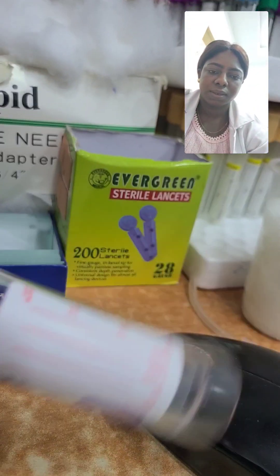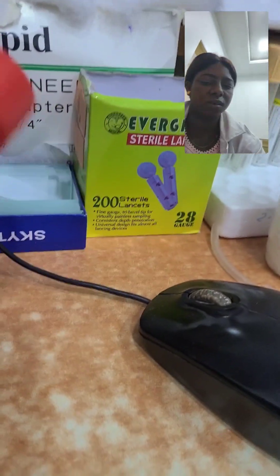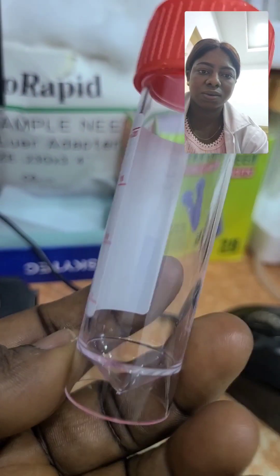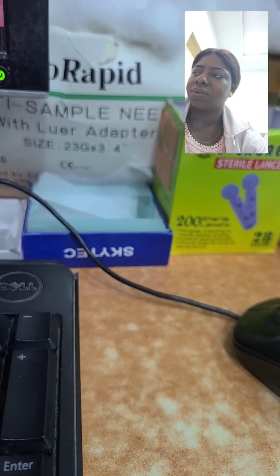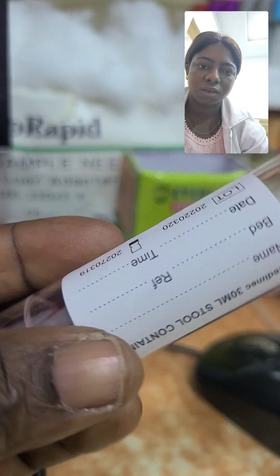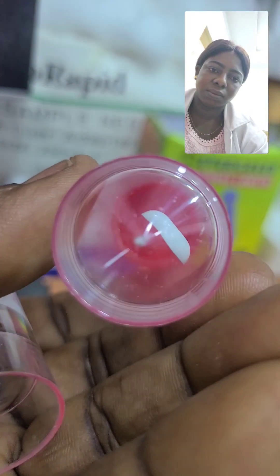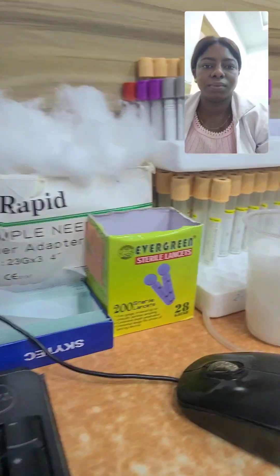This is a sterile bottle for urine analysis. As you can see, we label the container with the name, ID, and the test being done — for urine analysis or urine culture. This one with a small spoon inside is also a container used for stool microscopy and culture. The plain container is also used for semen analysis — seminal fluid analysis.